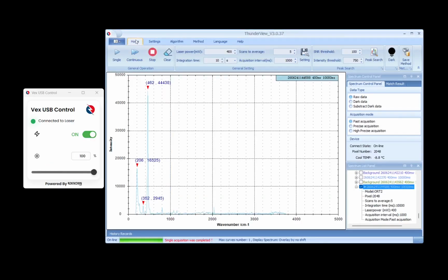So now let's get a new spectrum and try to match what we had in our database. I will slightly move the probe upward. And then let's turn off the laser and get a dark spectrum. Let's stop it for now. We don't want that many seconds. It would be fine to just reduce it to 2 seconds on 2 scans. Let's get the dark spectrum.